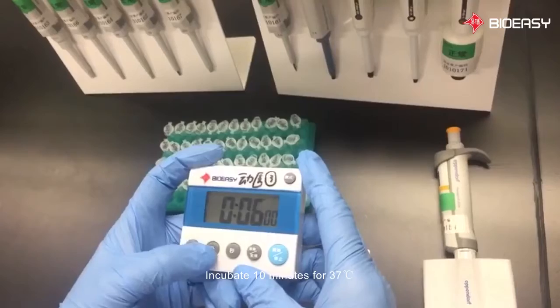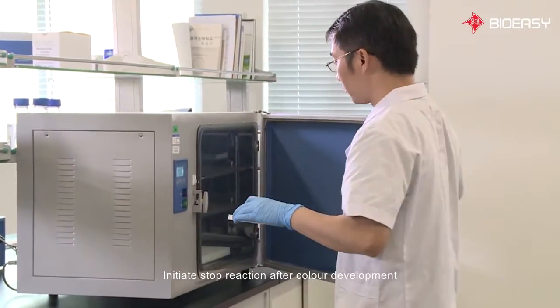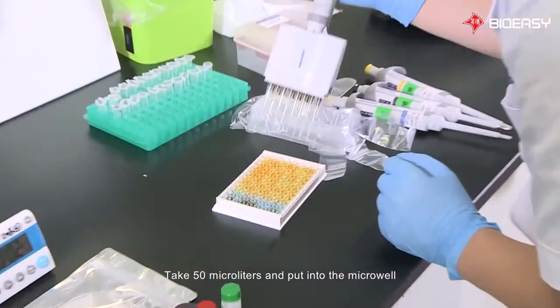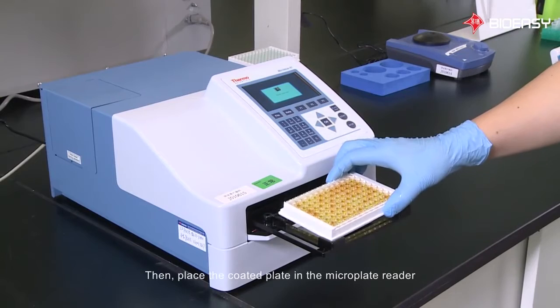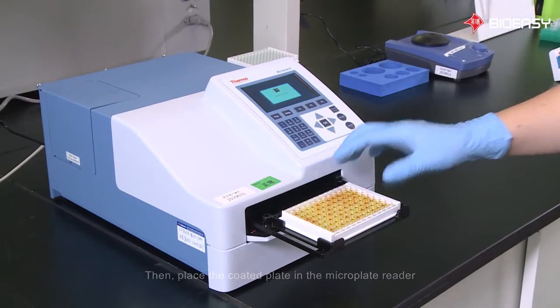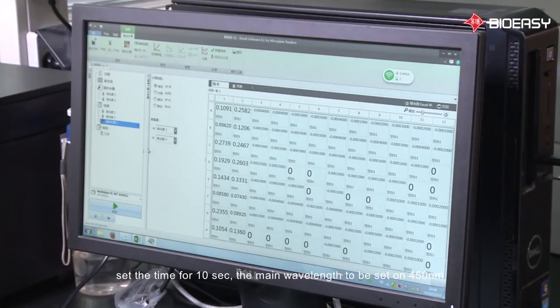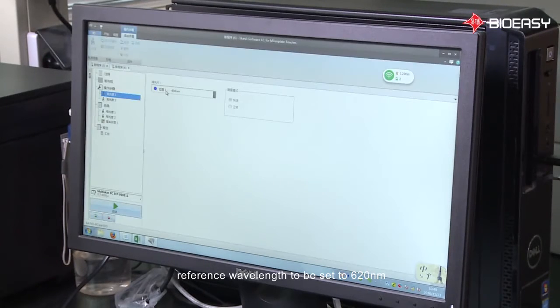Incubate for 10 minutes at 37 degrees Celsius, then initiate the stop reaction after color development. Take 50 microliters and put it into the microwell, then place the coated plate into the microplate reader. Open the reader software and set the time for 10 seconds, the main wavelength to 450 nm, and the reference wavelength to 620 nm. Click start.